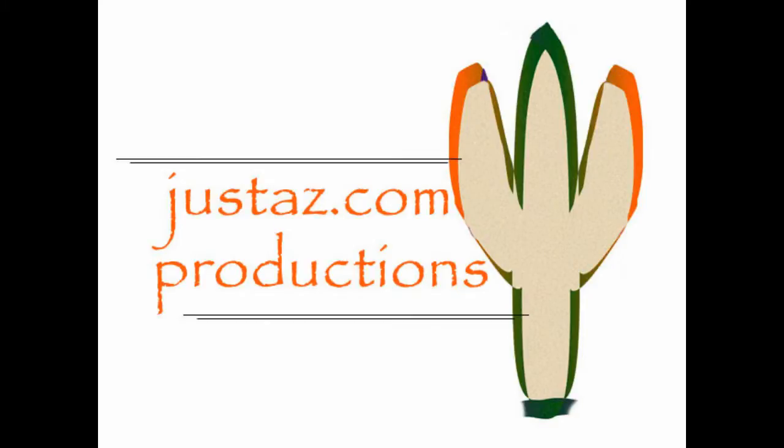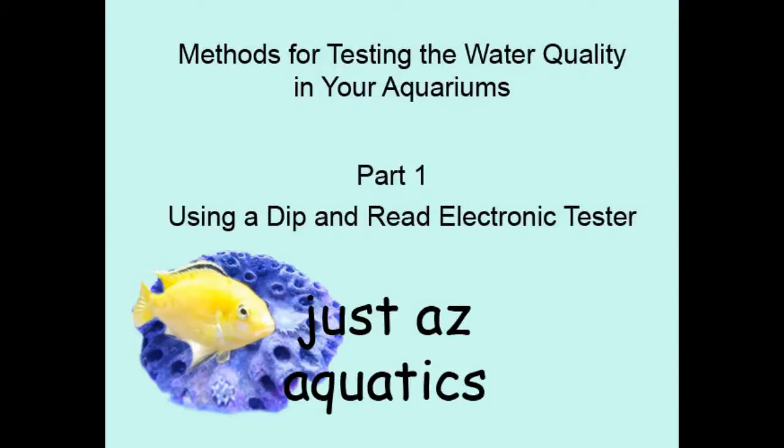JustAZ.com Productions with JustAZ Aquatics. Methods for testing the water quality in your aquariums — Part 1: using a dip and read electronic tester.